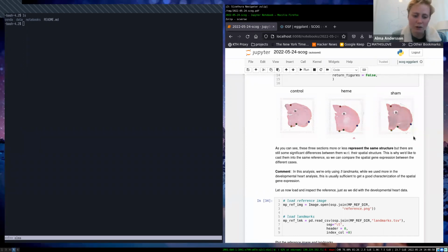When it comes to positioning with regards to rotations or shifts, where you put the tissue on the array, that doesn't really matter at all here. It's more about the stretching and weird distortions that are more problematic. One thing could be also that if there is a third axis, for example the Z axis, where you can decide where to collect your tissues from, try to take it at the same position in the Z axis, so we get a representative section from the same position. For example, the depth of the brain, we wanted to have it at the same position because it's easier to compare the structures then. But that would be my advice, I think.